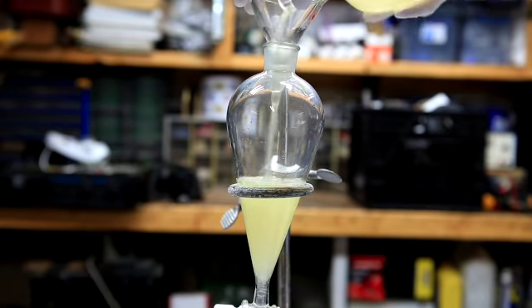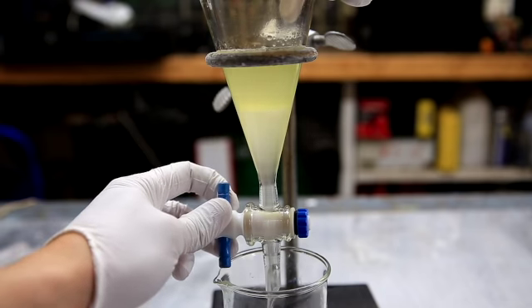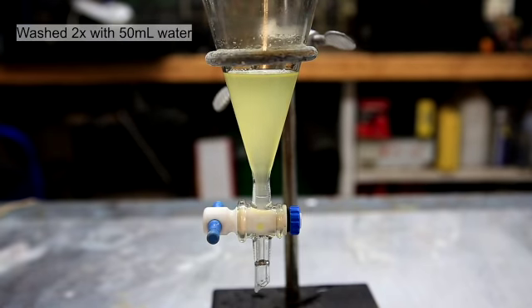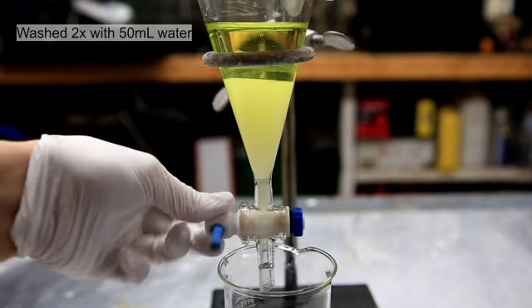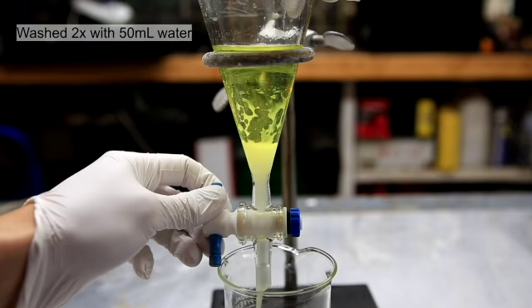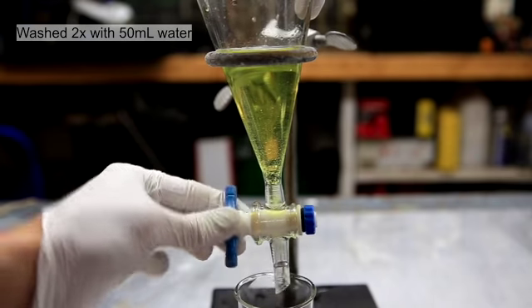The contents of the round bottom flask was then poured into a separatory funnel. The lower layer, which contains the acids, is drained away and discarded. The upper layer containing the nitrobenzene is washed twice with 50 milliliters of distilled water. Washing it with water allows for the removal of any acid that might remain in the nitrobenzene. Nitrobenzene is denser than water, so it becomes the lower layer, and this is the layer that should be retained.